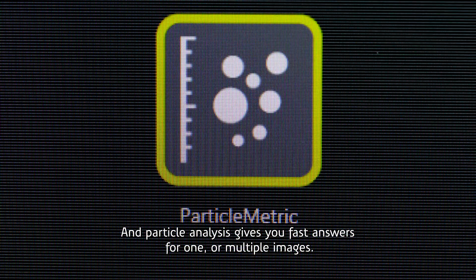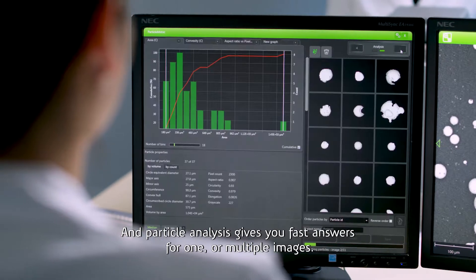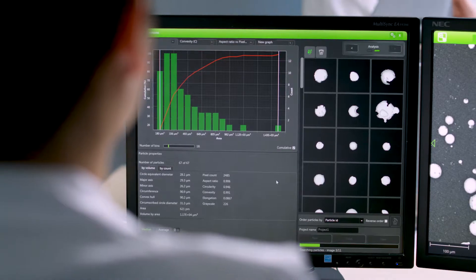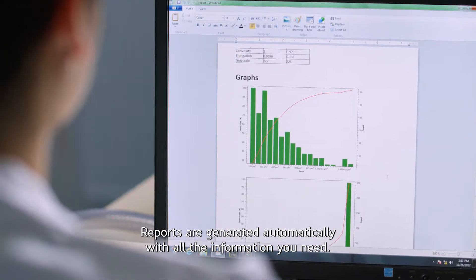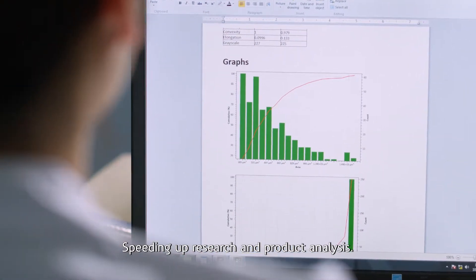And particle analysis gives you fast answers for one or multiple images. Reports are generated automatically with all the information you need, speeding up research and product analysis.